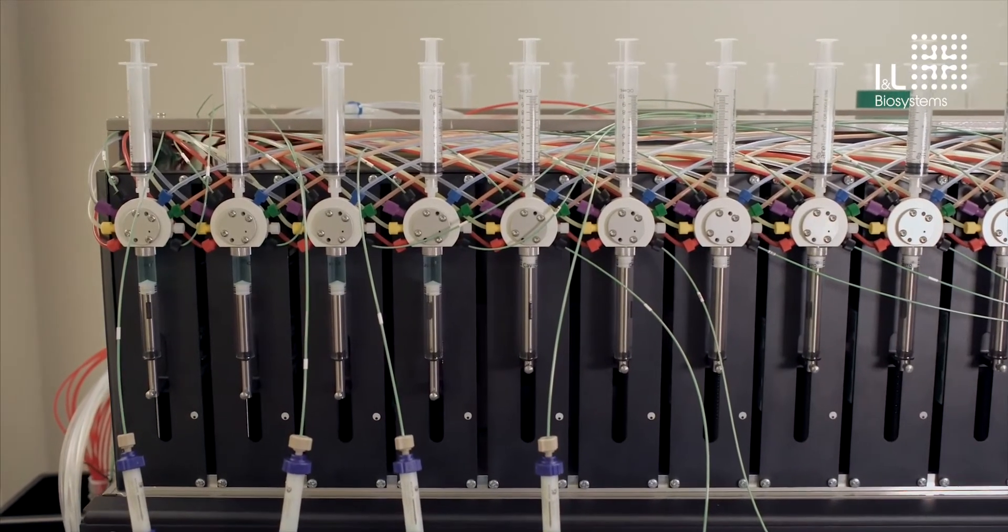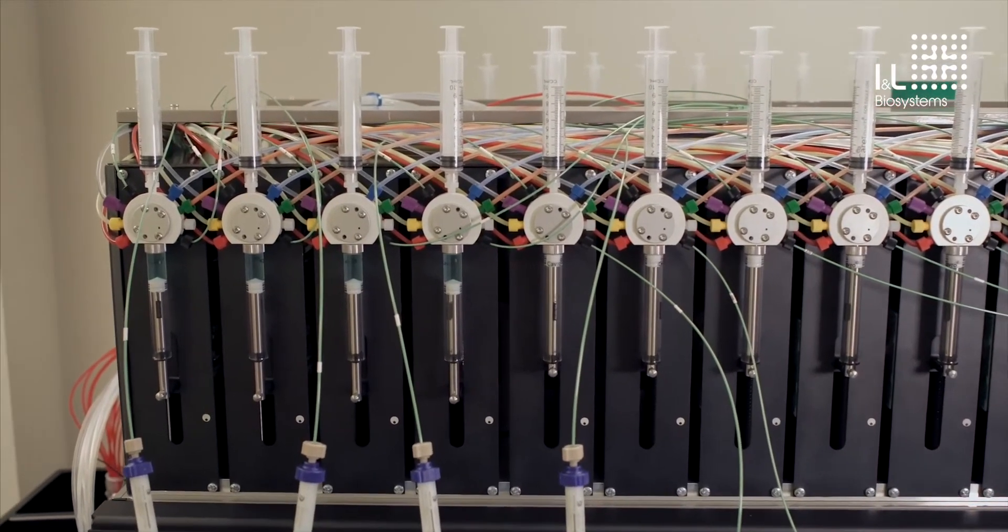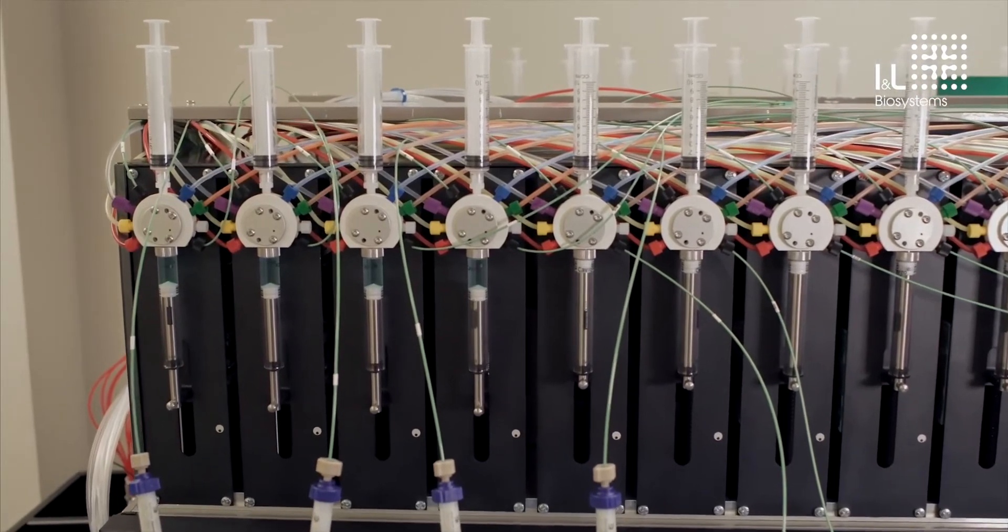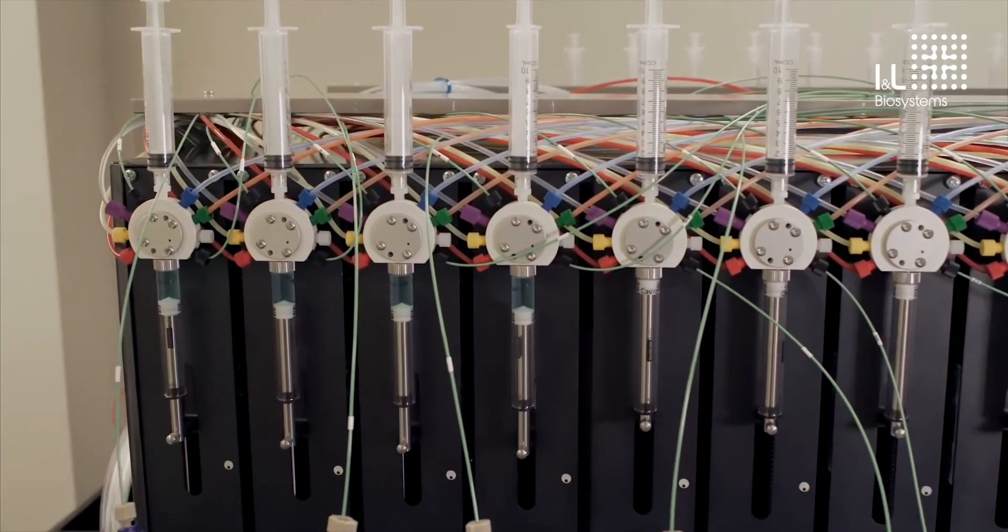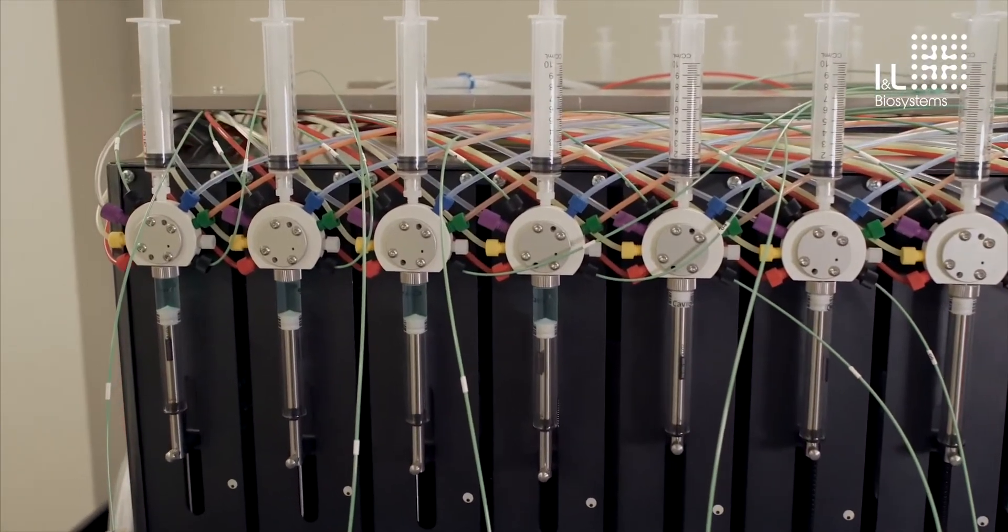Fundamentally, the Protein Maker is a very simple system. It is made up of 24 pumps, each connected to a 9-port valve.